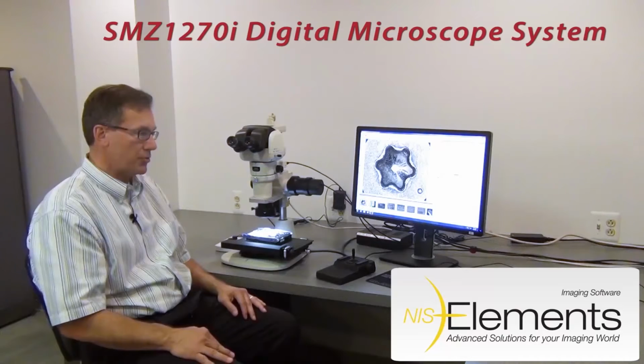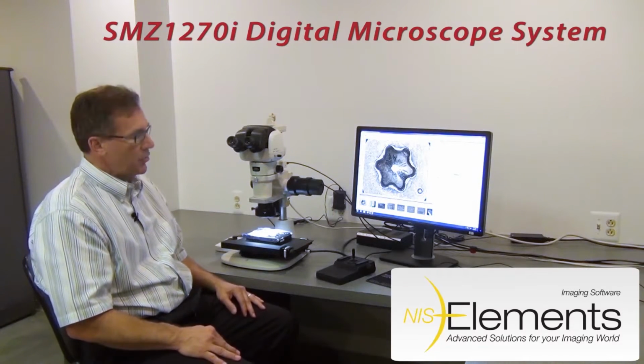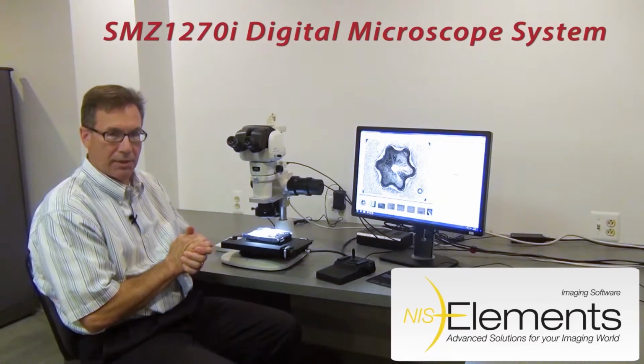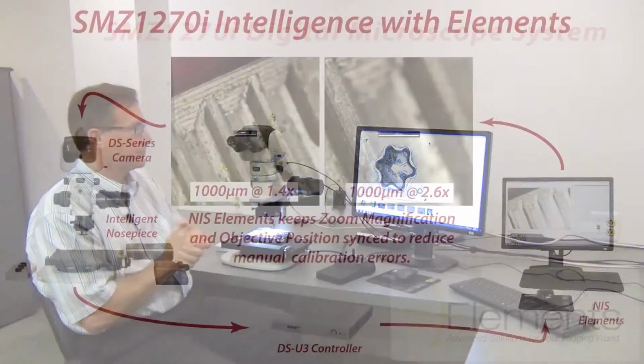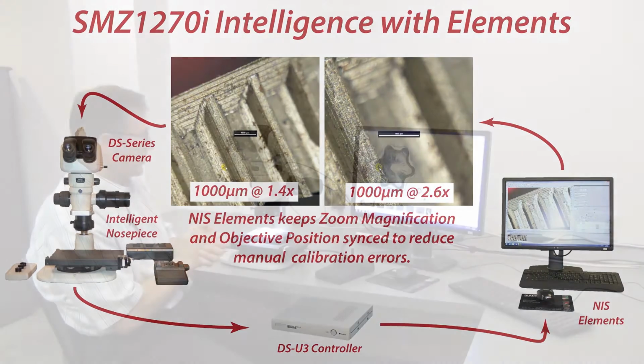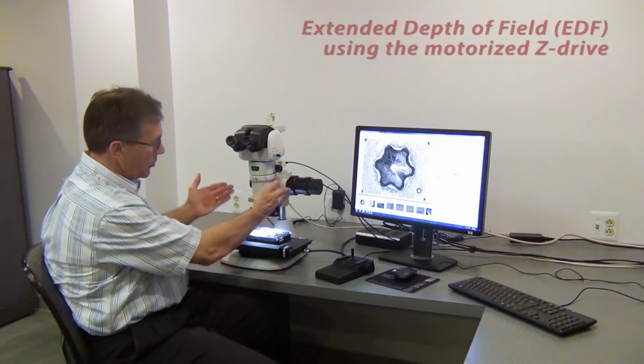I wanted to show you today the integration of our digital microscope system into Nikon Elements software and show you some of the highlights and features of the software. So there are two major functions I'm going to show you today on how we integrate the digital microscope with the software. The first major component is this motorized Z drive.